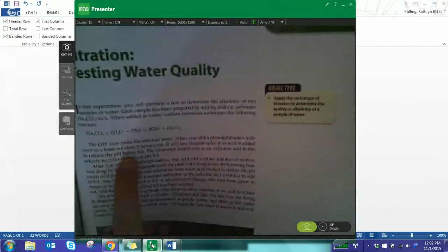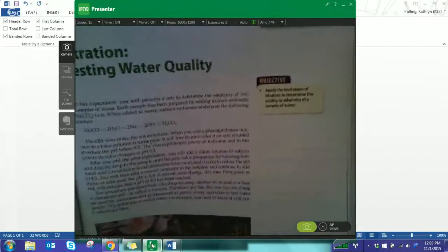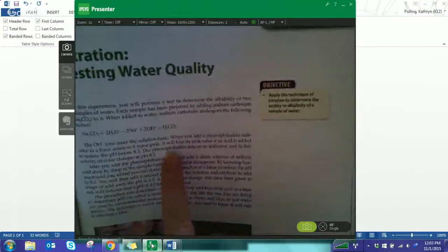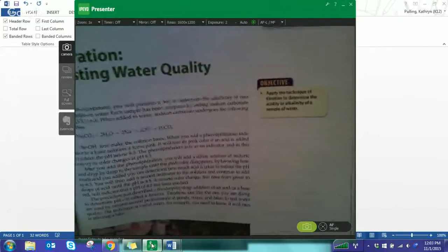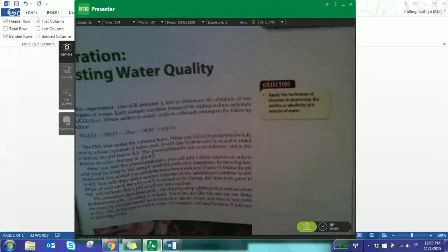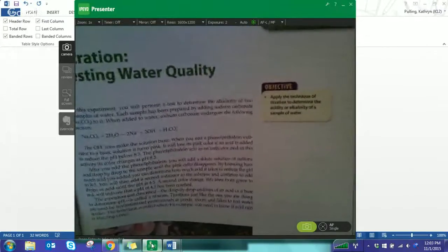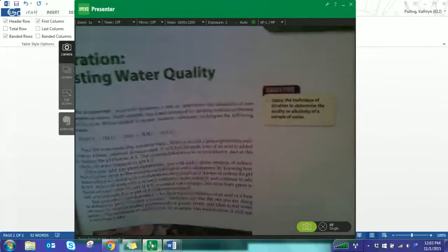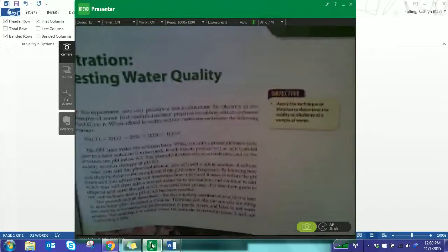All right, the first chemical that we add, the first indicator that we add is called phenolphthalein. All right, and it's spelled right there, really strange word. How you say it is phenolphthalein. All right, it will turn a basic or an alkaline solution pink or red if it is above a pH of 8.3, all right? And then it goes clear if the pH hits 8.3 or drops below that, all right? So then we're gonna see that color change.